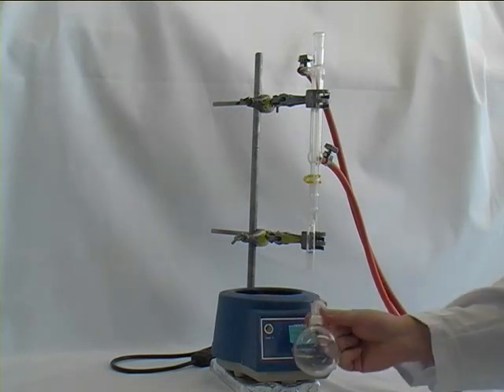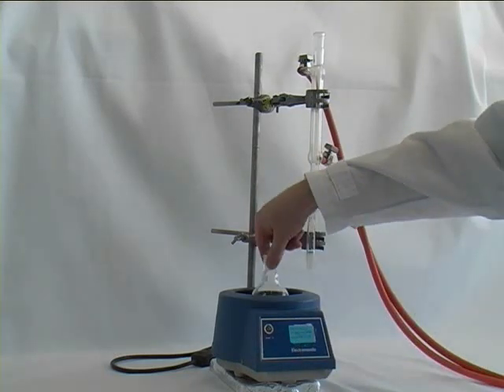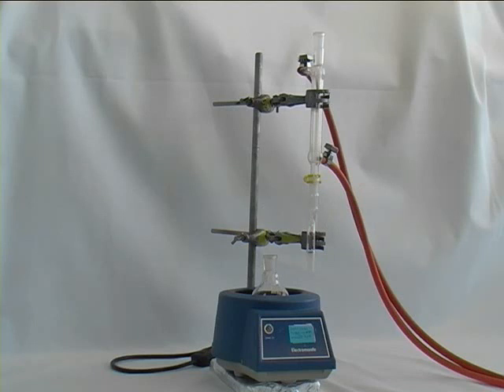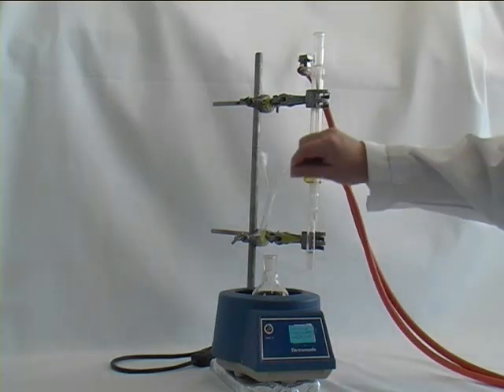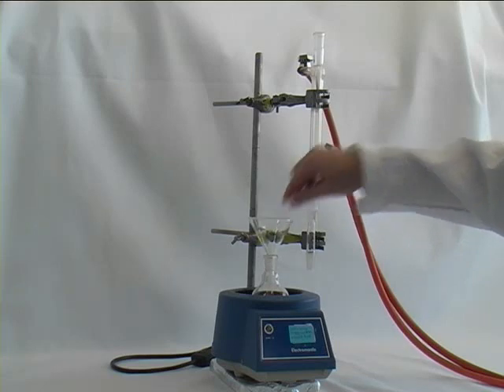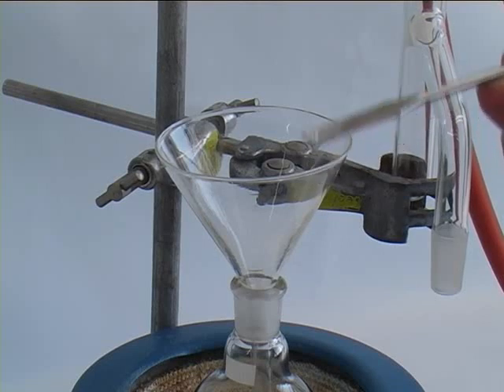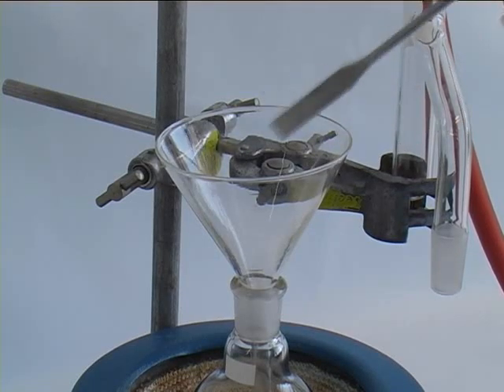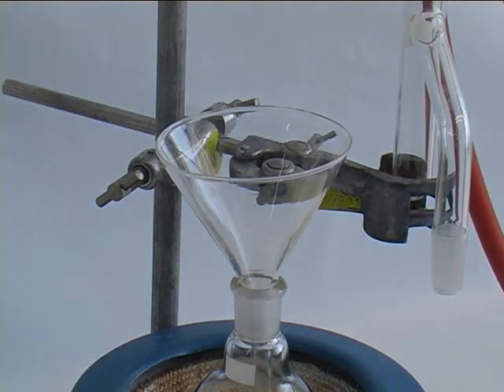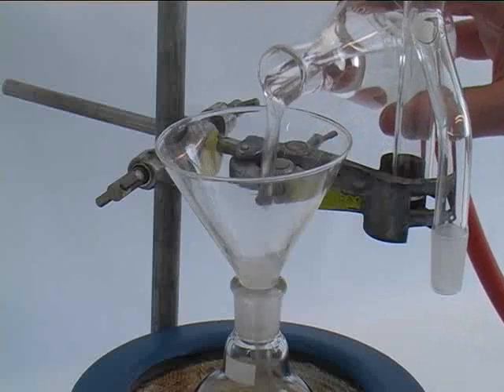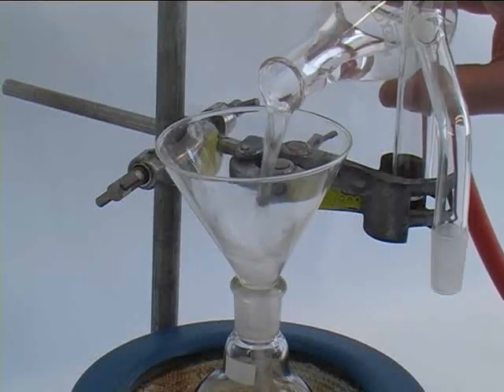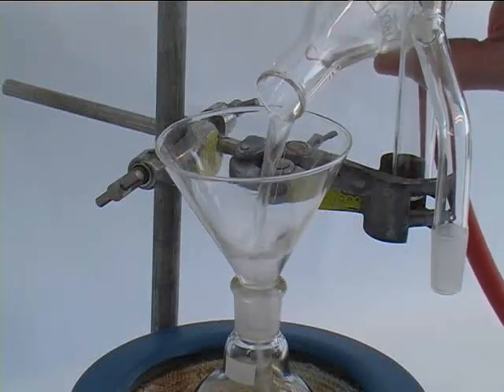What we have here is our round-bottom flask, where we have our solution. In order to add the solution, we will use a funnel. Then we add roughly that amount of anti-bumping granules, which helps the solution to reflux nicely without bumping too much. And finally we add our reaction mixture to the round-bottom flask.